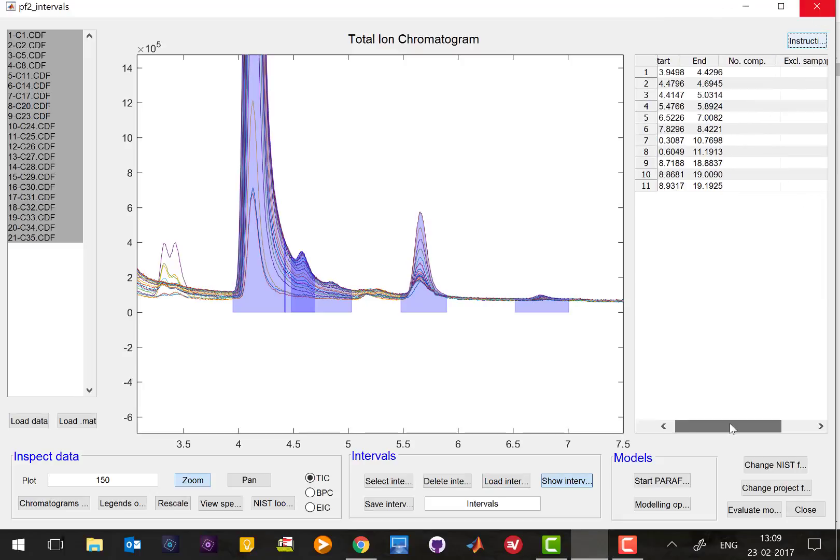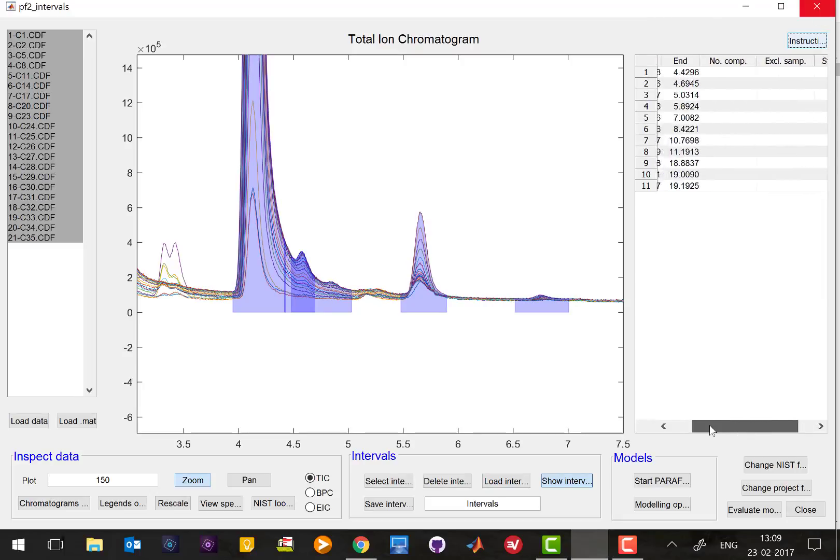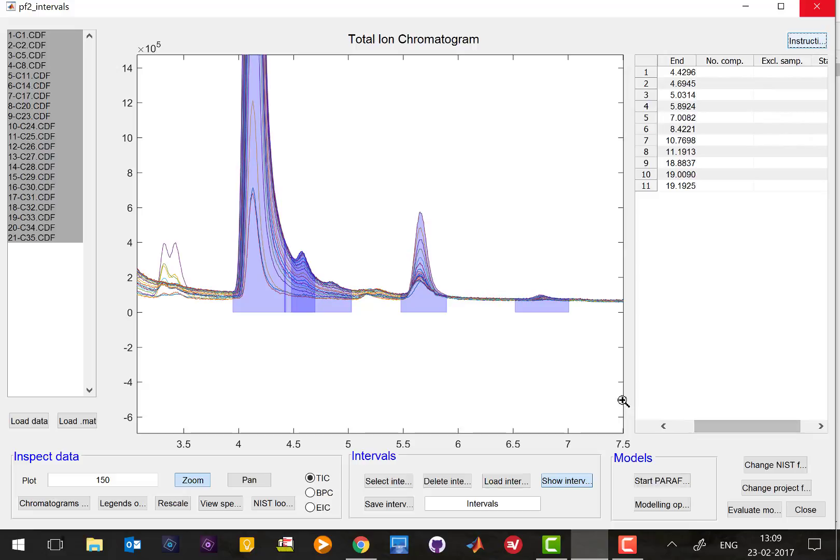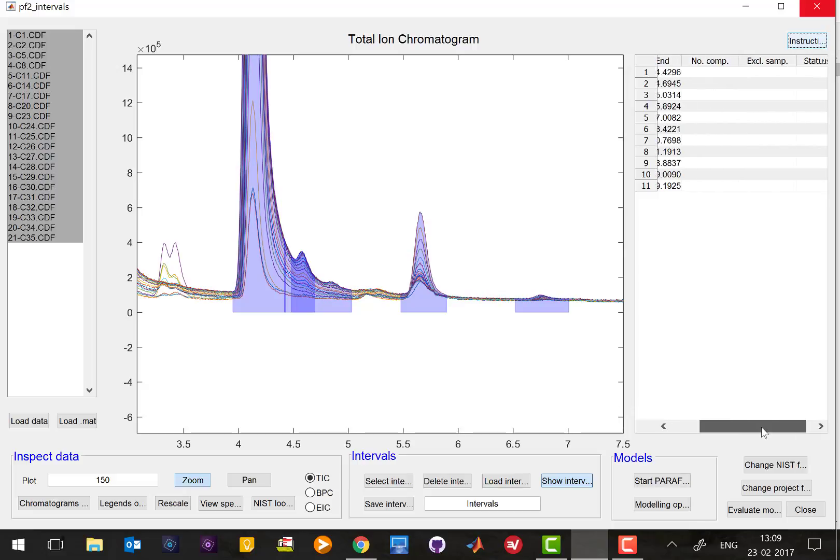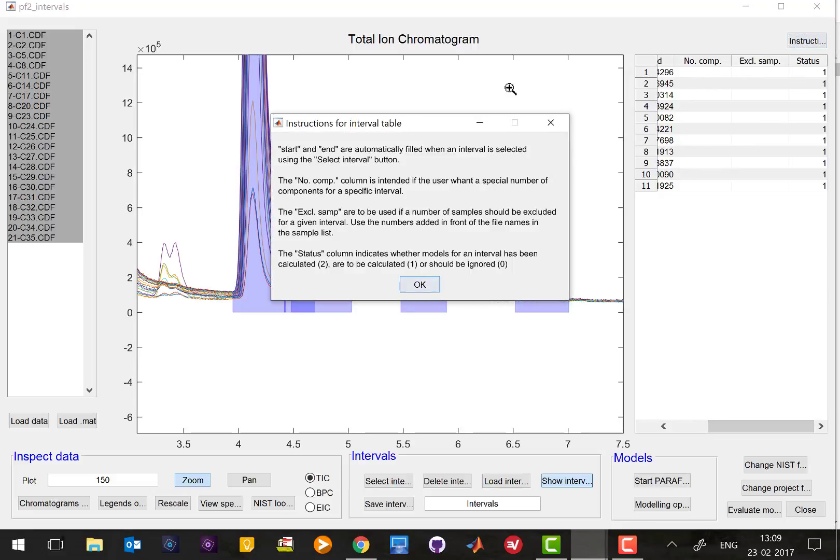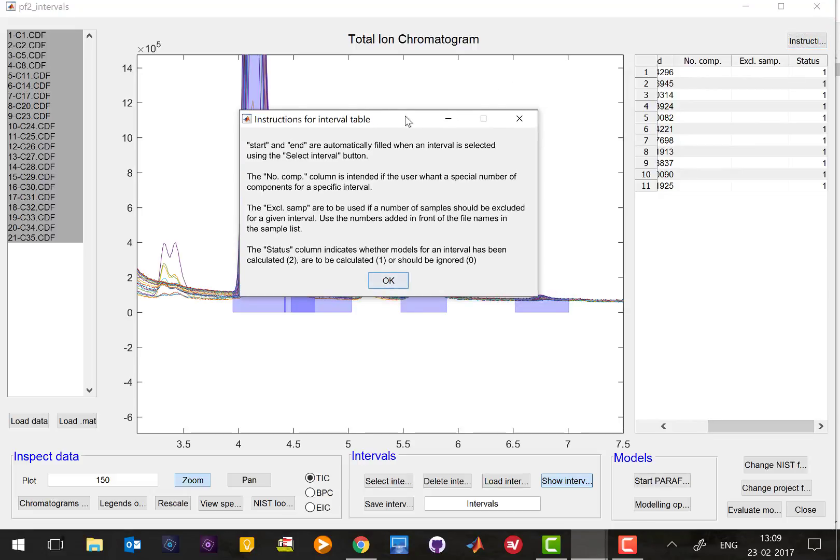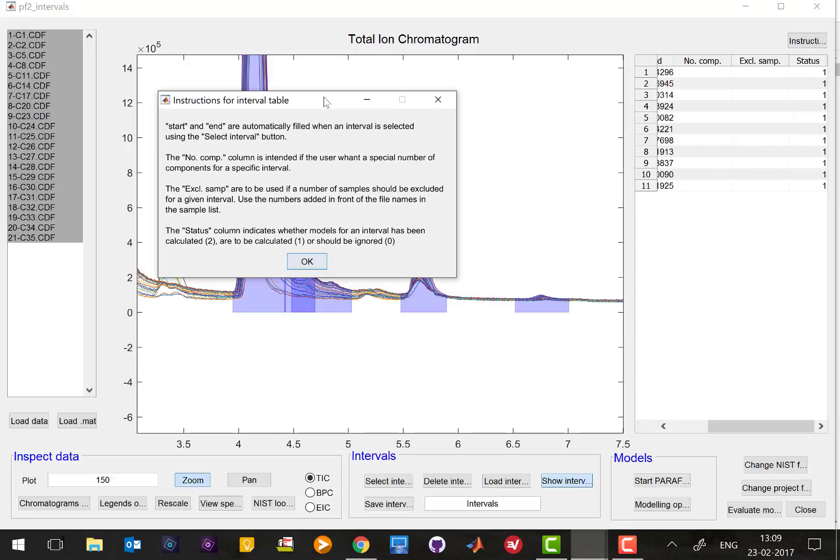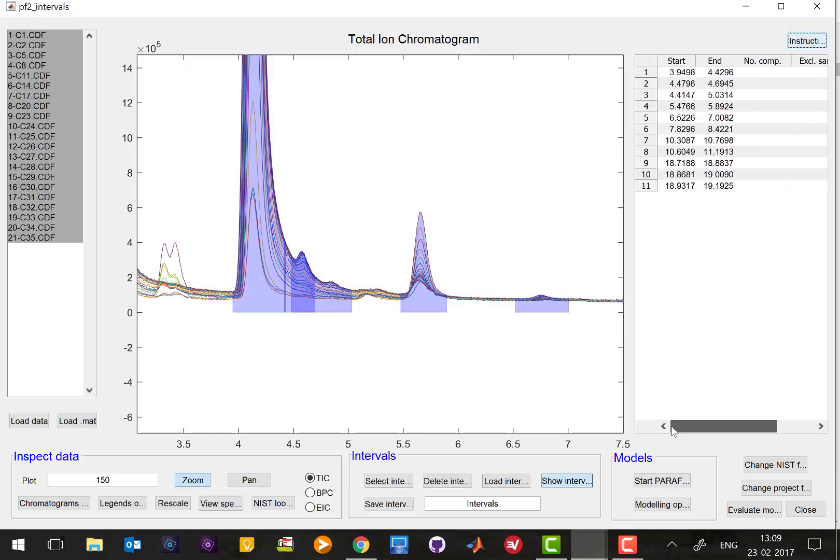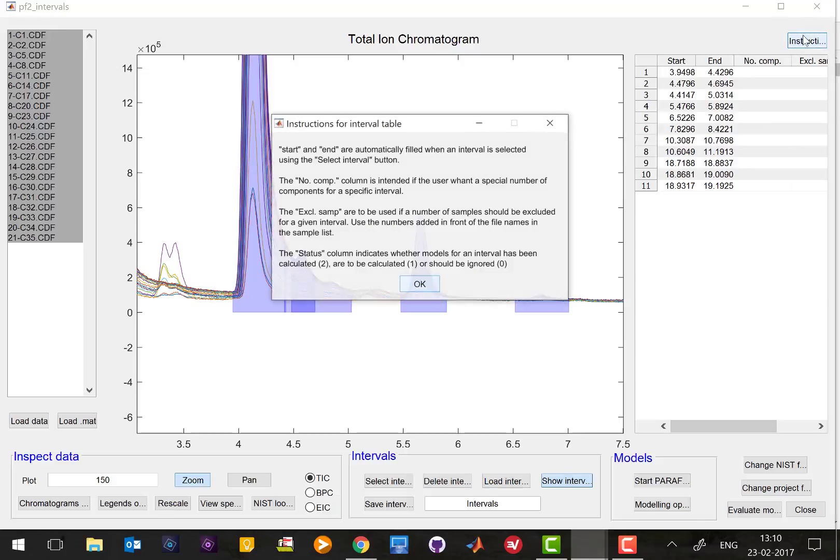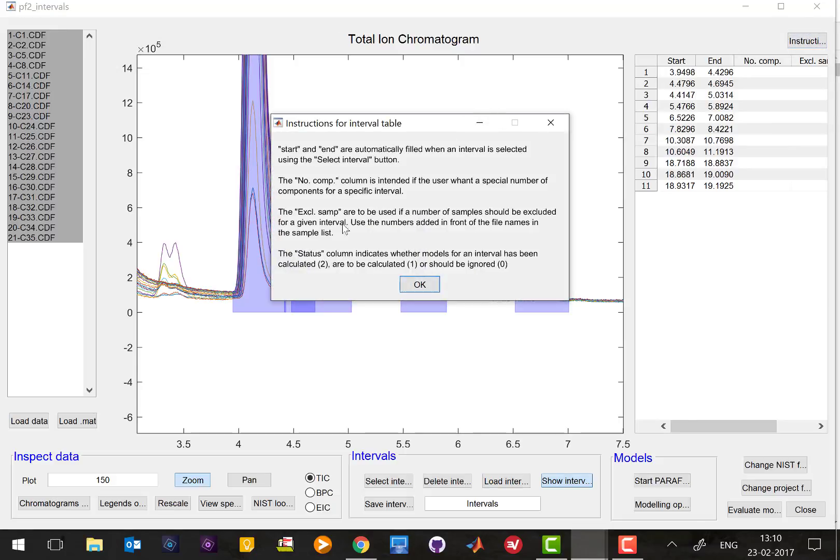So what Rasmus just showed you will apply to all the intervals that you have selected but if you go to the upper right corner and if you press instruction here it will show you in a separate window what all these columns mean.